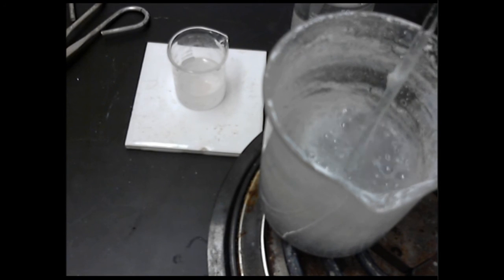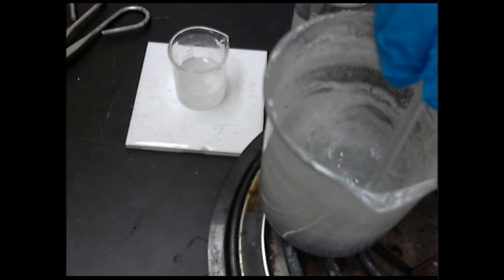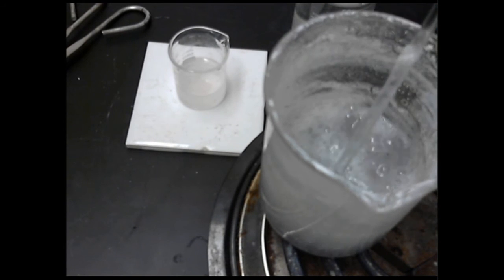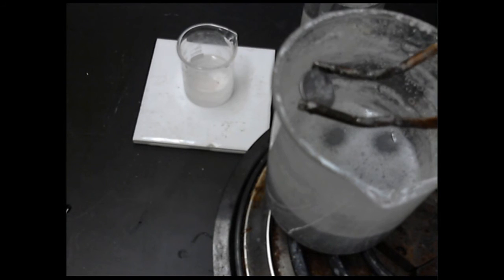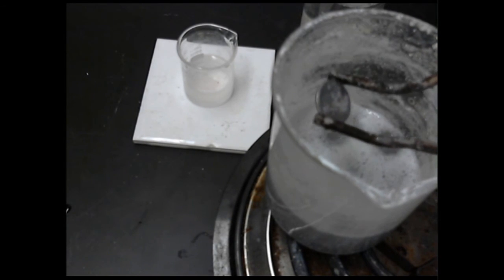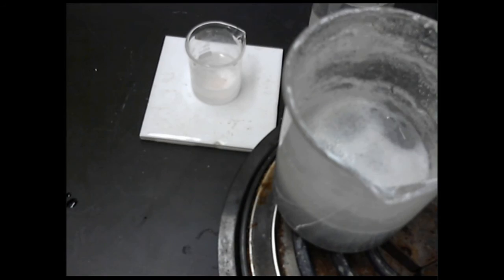I also want to make sure that the surfaces of the pennies aren't touching each other, because if their surfaces are touching each other, they're not going to get coated. After a little bit, we'll take these pennies out and see if they actually get coated in zinc metal. It's only been a couple of minutes and my pennies have already started to take on a silvery color. They're only finished when they've taken on a complete covering, so I'm going to put this one back in.